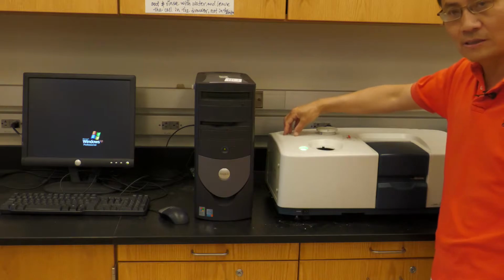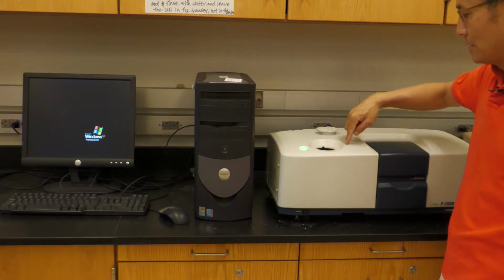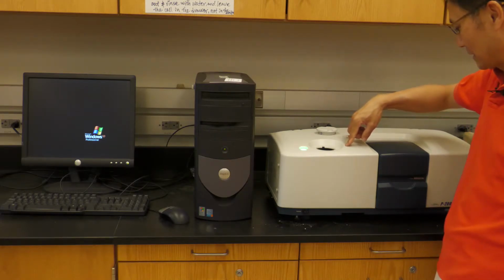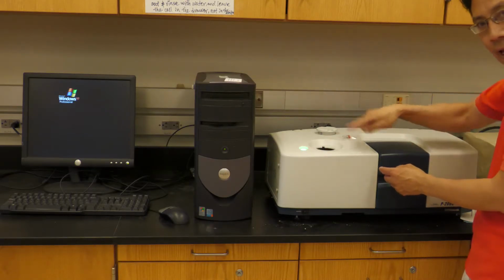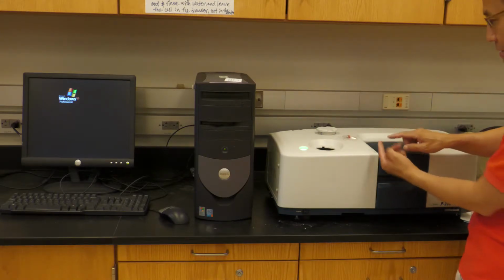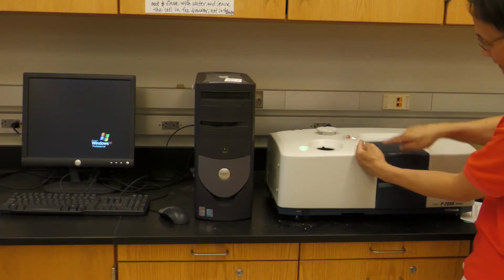This is the light source, the tungsten light source. We direct it here, pass this one, just the yellow light goes through this one, sodium light goes through this one. Then here is a polarizer, because this one is a single color, but the vibration is in any direction. So after the polarizer, the vibration is in just one direction. So this light is shooting in this direction, the vibration in this direction.